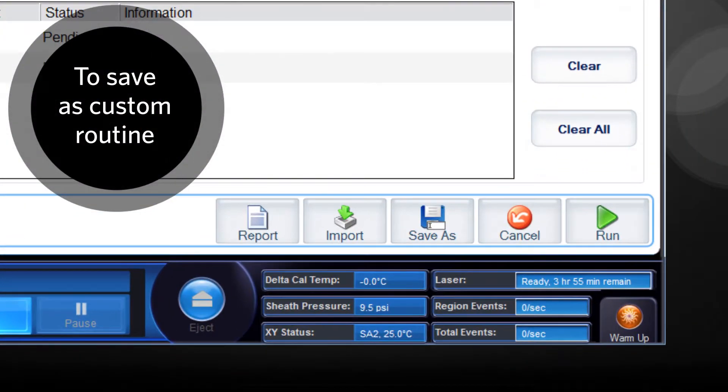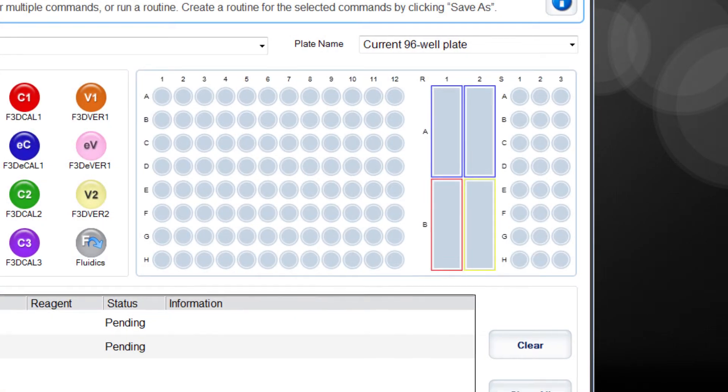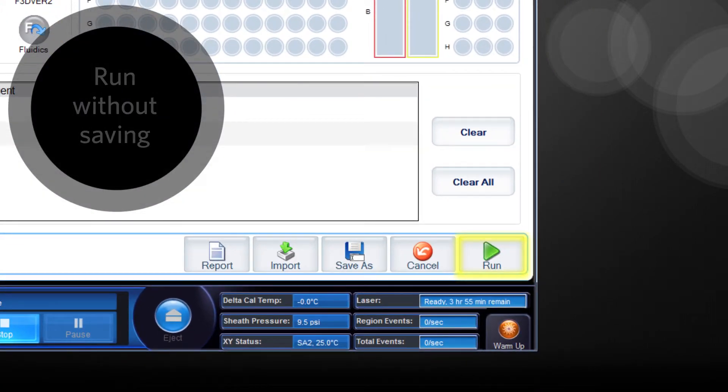The routine can be saved as a custom routine by clicking the Save As button and typing in a routine name, or can be run without saving by clicking the Run button.